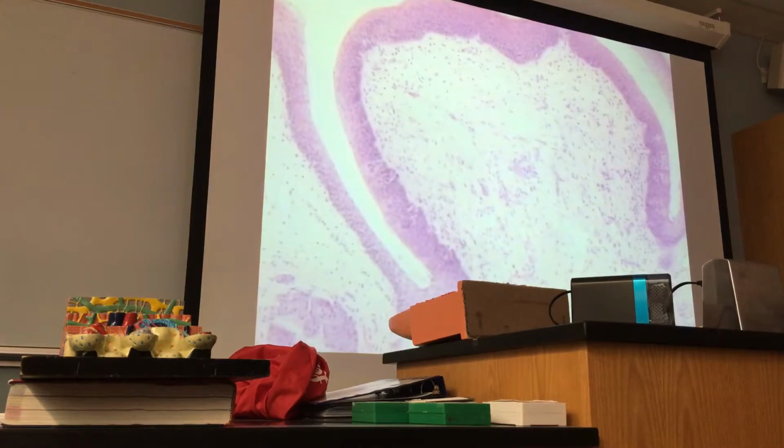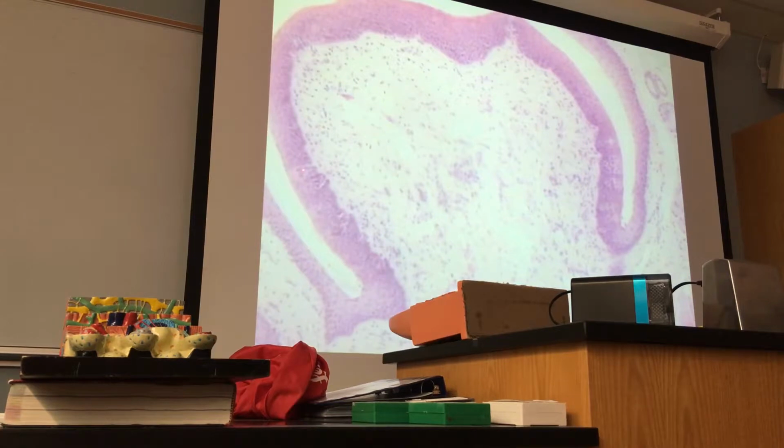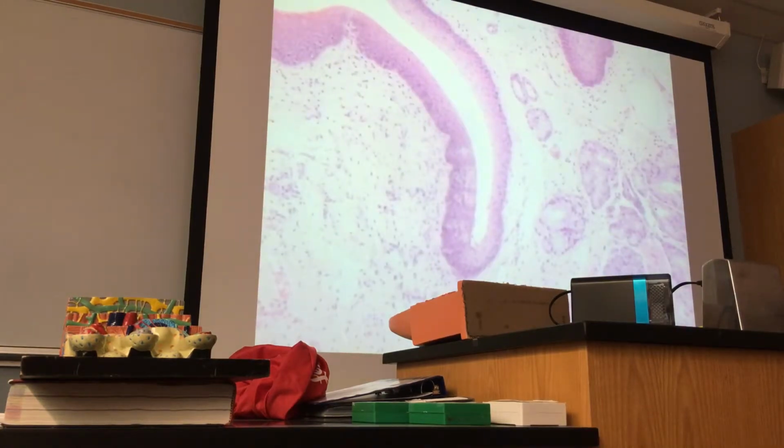And let me go for this magnification. And these structures, these are taste buds. Under even higher magnification, you will see the taste buds better, but I would like to point out these acini. These are glands. The glands present in the tongue.